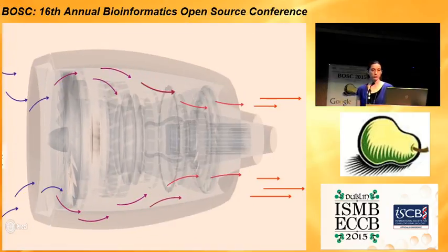So that was the input. Now what do we want to do with this? Because if I just stop here, you'll think, well, there's a software, there's a technique. What are we going to do with this? That's not a problem, but as happens everywhere in the genomic area, the technique is not used only for genotyping anymore. It's been widely used for other purposes such as finding new genetic markers.